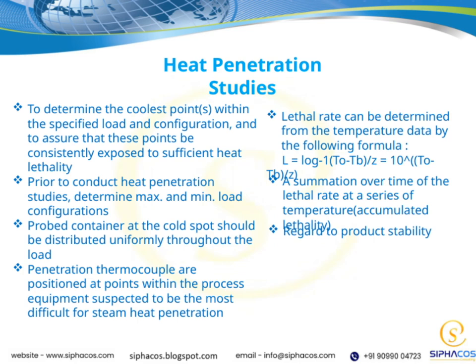Now, to ensure the process is effective, we need to identify the coolest spots within our load and configuration. These are the critical points, because if they reach the necessary lethality, the entire load is properly sterilized. Our goal is to make sure these points are consistently exposed to enough heat to achieve the desired microbial kill. Before we start any heat penetration studies, it's important to determine both the maximum and minimum load configurations. This helps us understand the range of conditions the product might experience, ensuring our process is robust enough across different load scenarios.